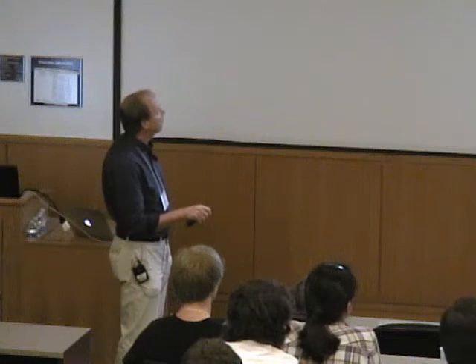Typically, of course, if I'm looking at a metal center, it's going to be surrounded by some number of ligands and then perhaps protons in the protein and so on. If I have a group of equivalent nuclei, I get 2nI plus 1 lines for the group of equivalent nuclei. And if I have several groups, the number of lines is the product of 2nI plus 1 for each group of equivalent nuclei.